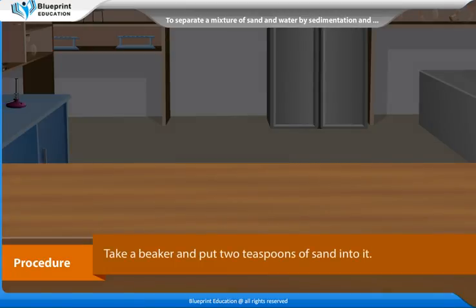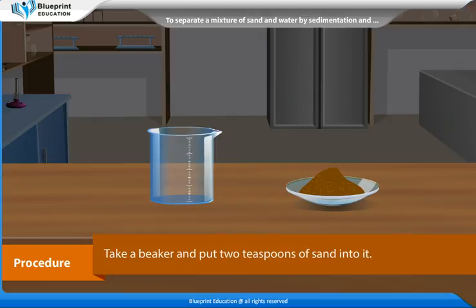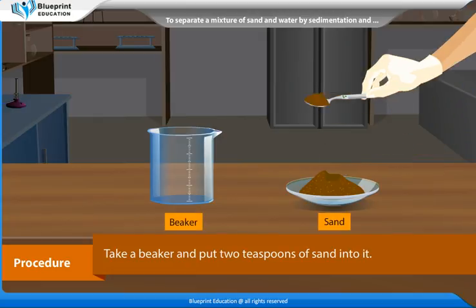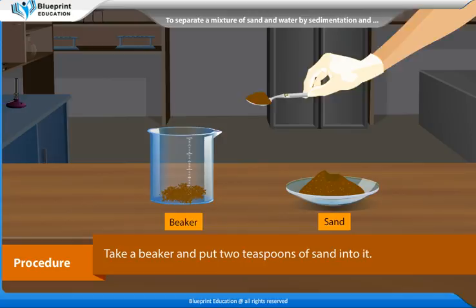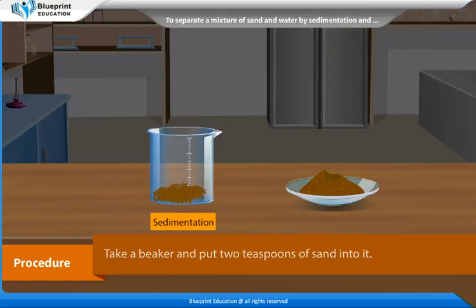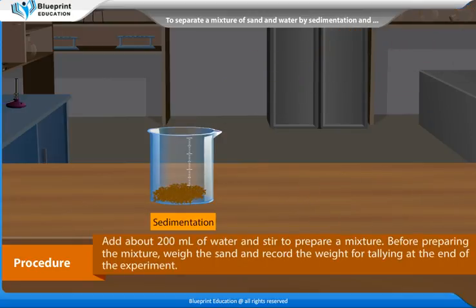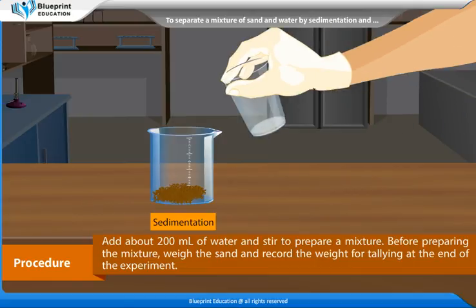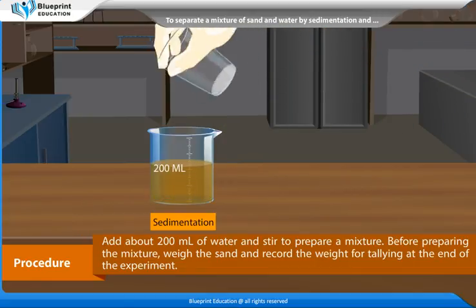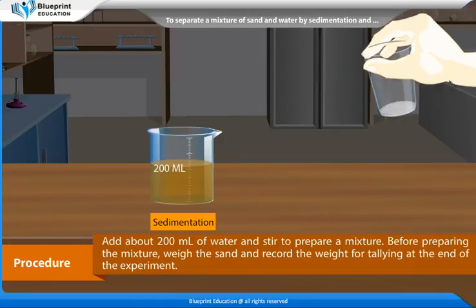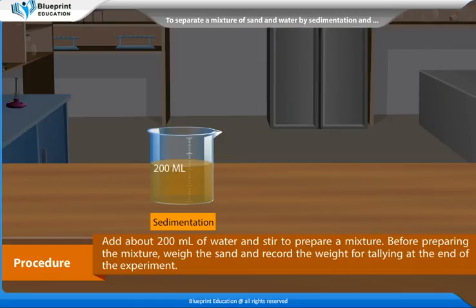Procedure: Take a beaker and put 2 teaspoons of sand into it. Add about 200 ml of water and stir to prepare a mixture. Before preparing the mixture, weigh the sand and record the weight for comparison at the end of the experiment.